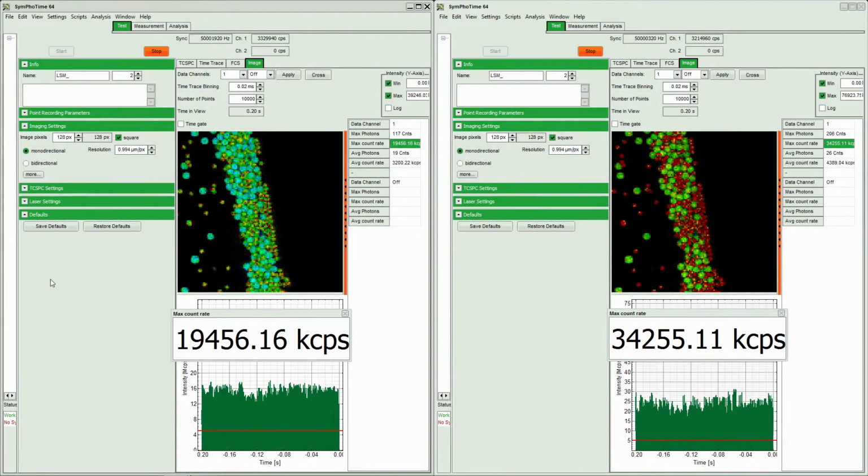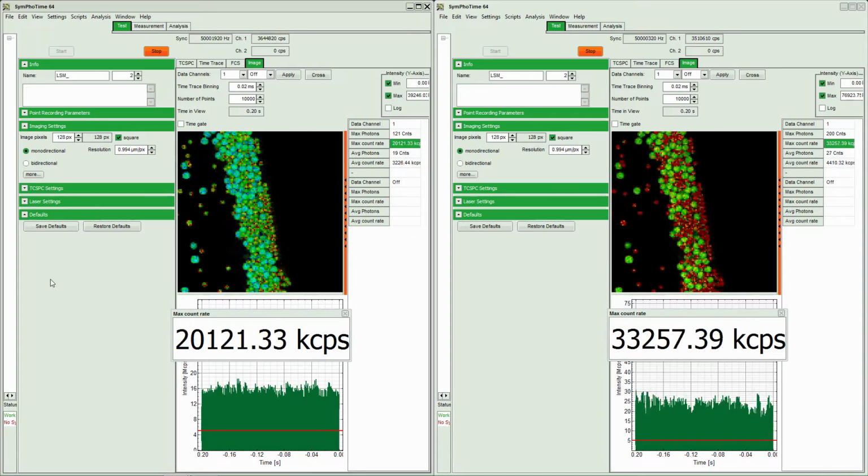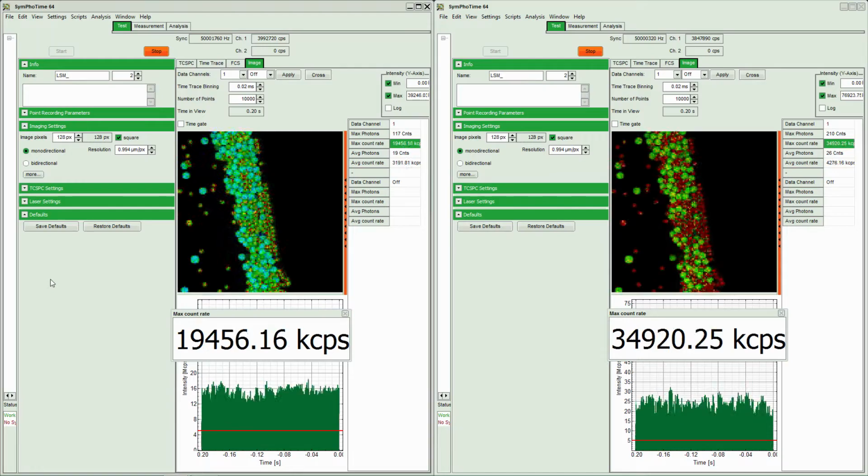In this example measurement, the diffusion of two kinds of dye-labeled beads are monitored with rapidFLIM. The method is fast enough to follow particle motion in solution. The large beads were labeled with Nile red exhibiting a fluorescence lifetime of 3.3 nanoseconds. The smaller bead population contains the dye Dragon Green with a fluorescence lifetime of 4 nanoseconds.